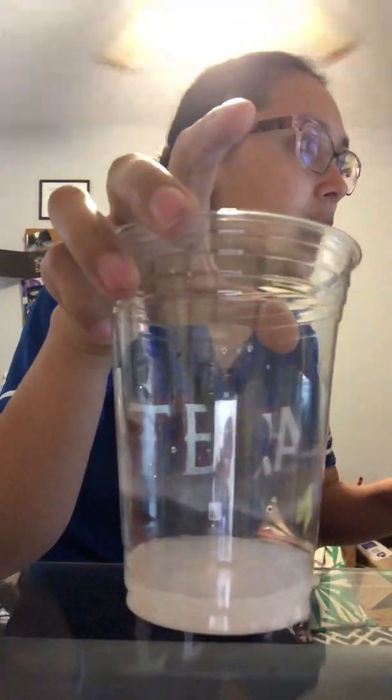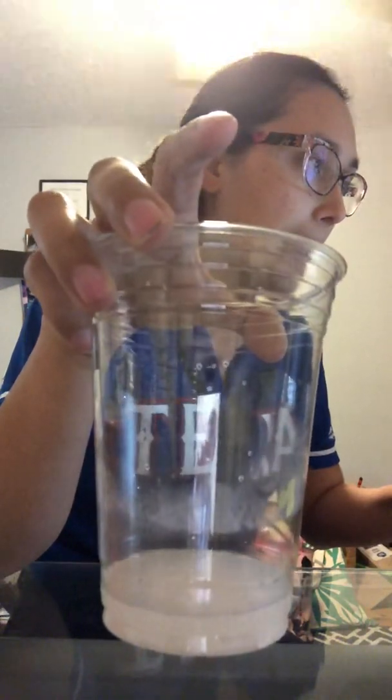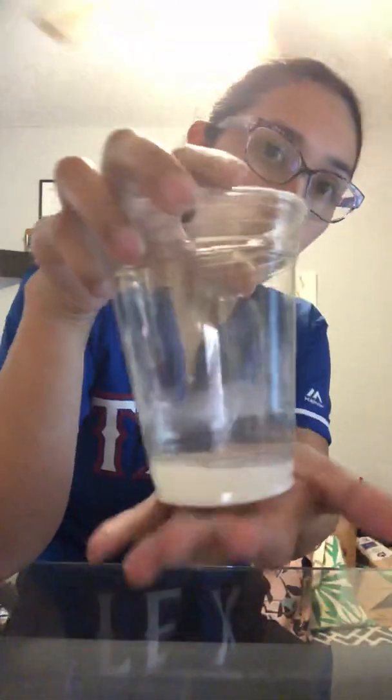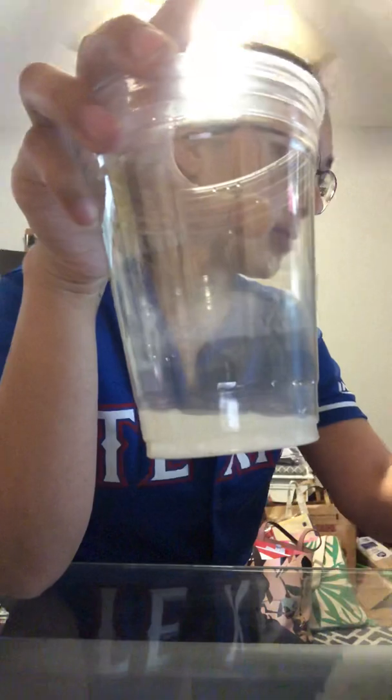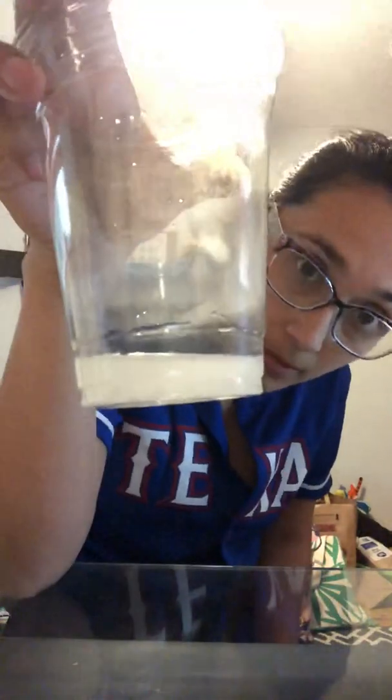It's bubbling, so mix it some more. Ooh, there's a temperature change. It's getting really hot. The crystals are dissolving.